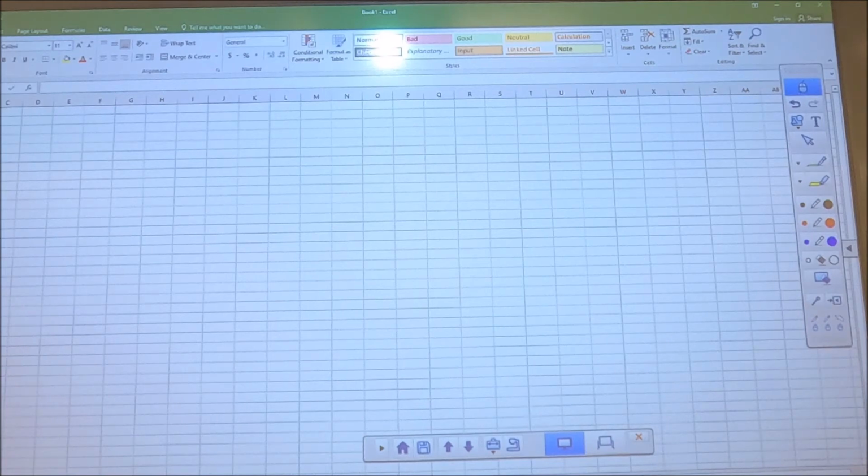Now, you're going to go 0.2000, 0.175, 0.150, and 0.125. Those are your points. And then you're going to write absorbances in here. Okay, I'm not going to do the ones that you just got because I'm not going to do the graph for you.